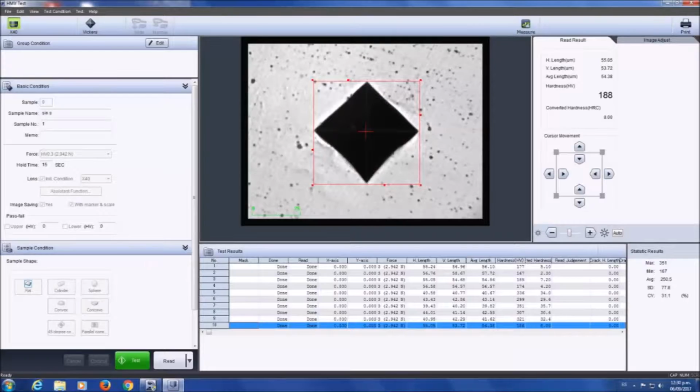We made 10 Vickers tests on the weld plate and 3 on the normal steel plate, to compare the hardness of the material. Now in the images we can see the test results of the 10 proofs for the material with arc weld.